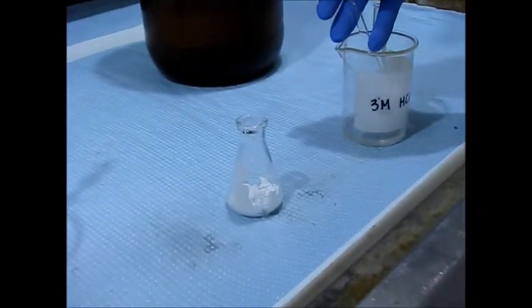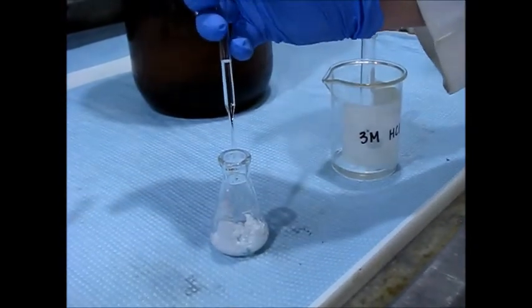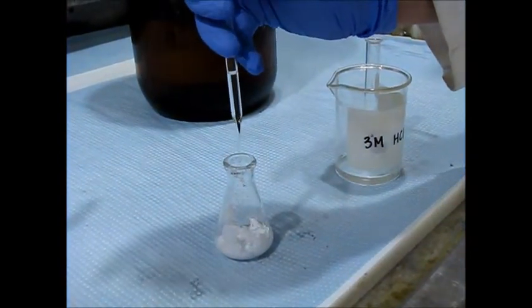You do want to be careful with the hydrochloric acid, as it is an acid and it will burn you. Just add a couple drops.